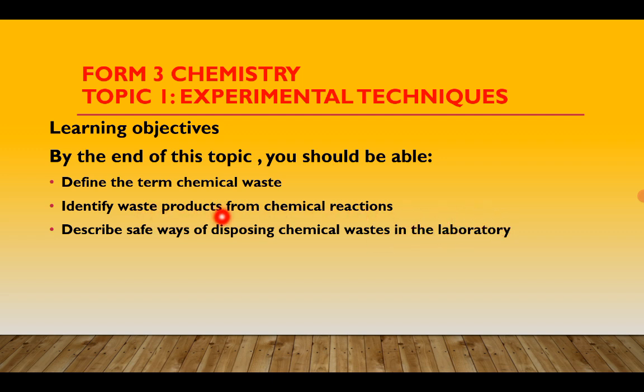So we must come up with safe ways of disposing these chemical wastes. Dispose means to get rid of, so that the chemistry lab remains as safe as possible to work in.